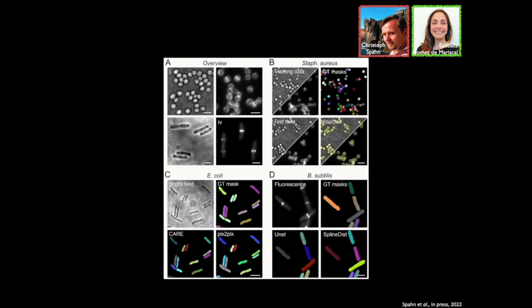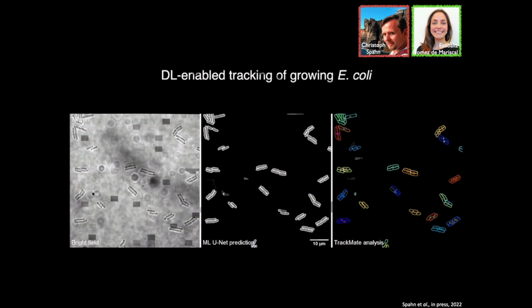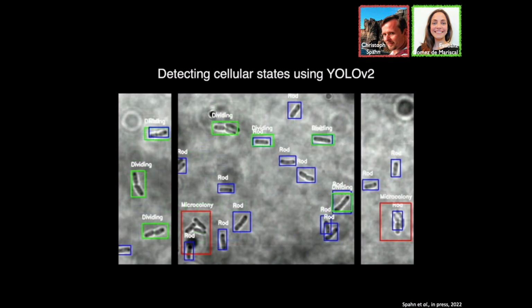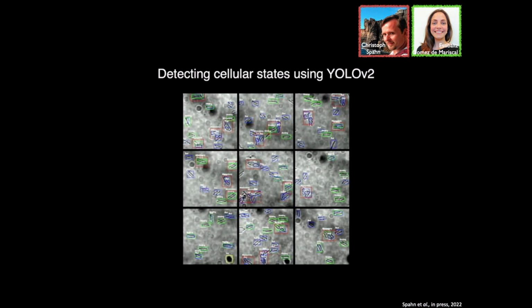And you see most of the tasks, and a few more that we've added to ZeroCost, to directly process data from bacteria. And you have a few fascinating things, like, for example, phenotypic classification for drug discovery, which is what you're seeing here, where we pick up on morphological features that change in bacteria, or even division progression, when they are exposed to different drugs.